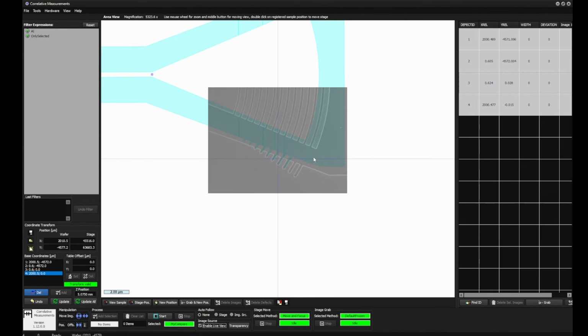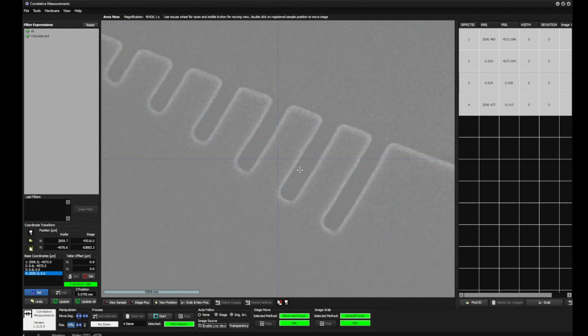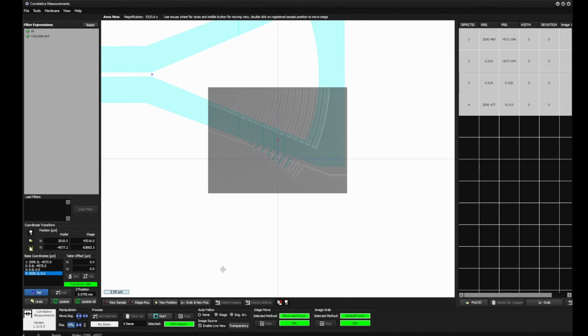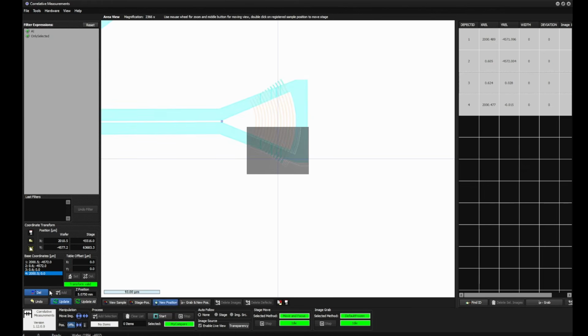Therefore, for this, we can actually use a stage offset. We can actually move the whole thing to the right position so that we have locally a perfect match. And now if we are looking for smaller structures, we can exactly hit the right area. The good thing is with this manual offset, you can delete it afterwards, and then you are back to the settings which you have from the basic alignment. So you can redo this at different positions to get maximum precision.